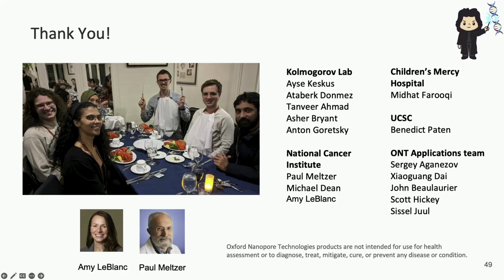For the osteosarcoma, we get a pretty nice purity because it's like an amputation. But for the other cell lines, I think we get below like a 50% tumor purity, and it's working well. But that kind of depends on what you expect. If you're at 50% and low coverage, you may not be able to get enough subclonal events. But for the clonal events, it won't be a problem.